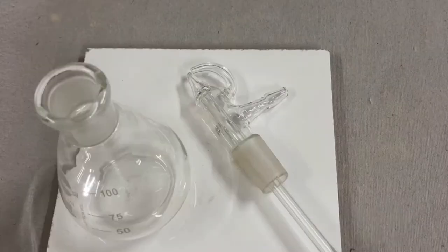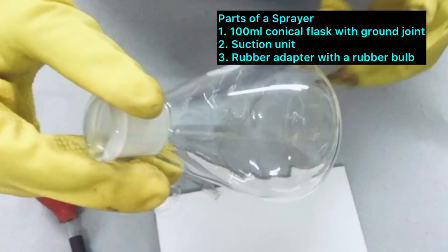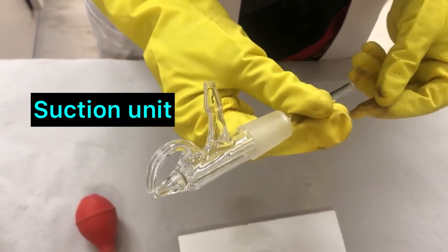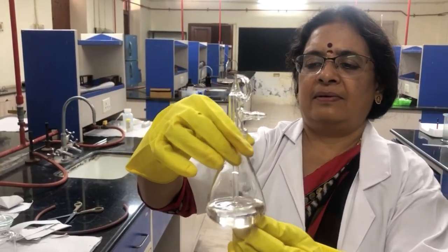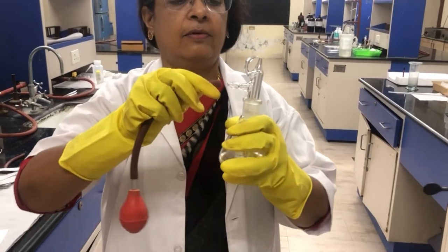A sprayer is shown here. It has a small flask with a spraying unit and a rubber adapter. Take the required spray reagent in the flask, fit the rubber adapter, and it is ready.